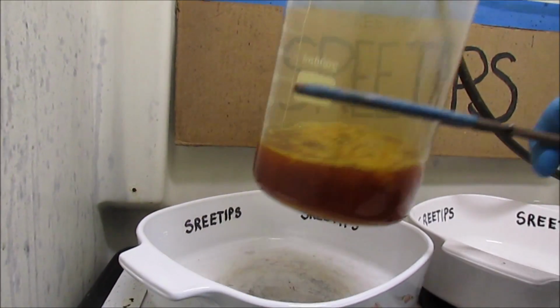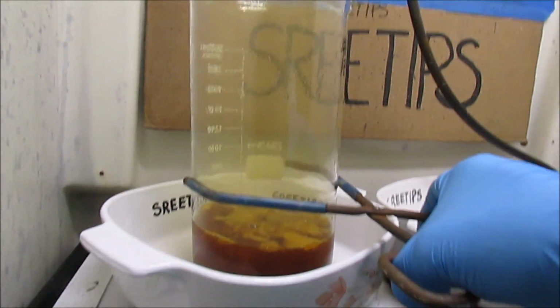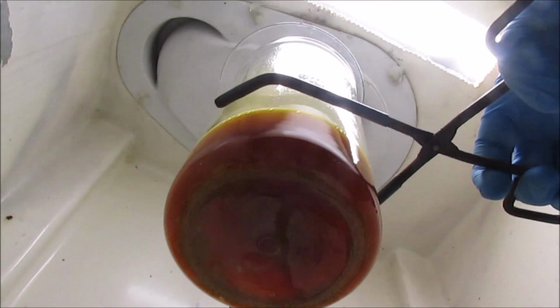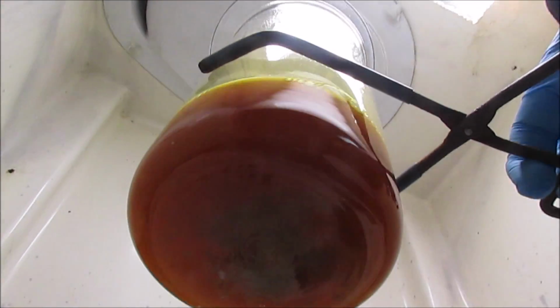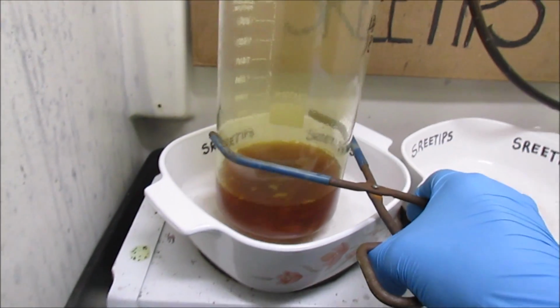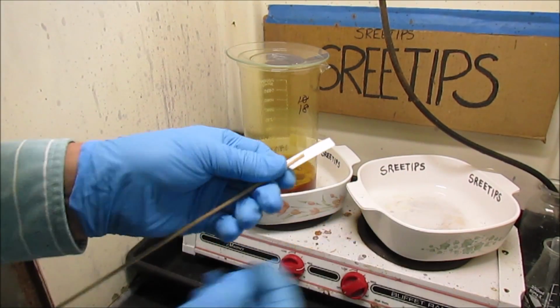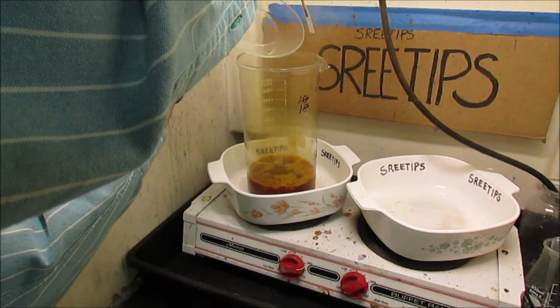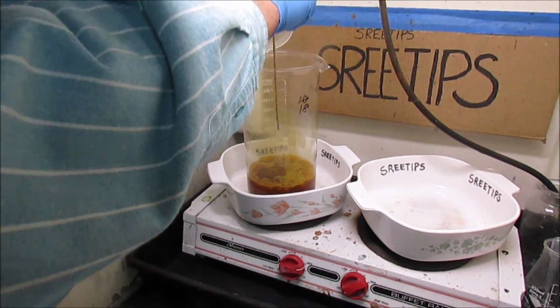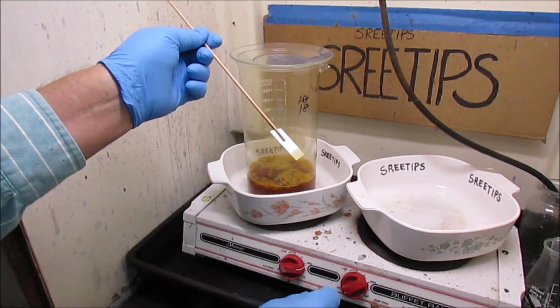I think it was up to about the, what is that, about the 400 ml level with hydrochloric. And it's only been on there about 10 minutes. Looks like everything's pretty much gone into solution. Get a quick status test on this and see what we got. I split a piece of bamboo with a knife, and I stick my filter paper down in there to get some of it on the paper without having to stick my hand way down in the beaker. And now we're going to put some stannous on here and see what we got.